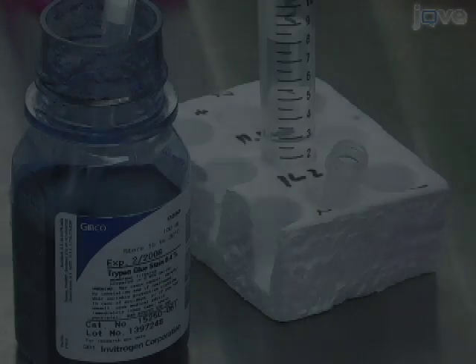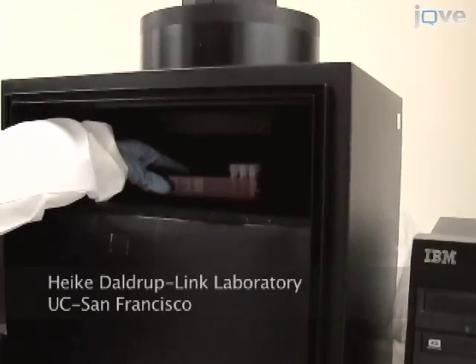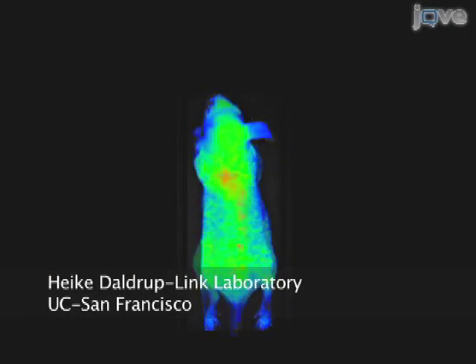This is our two-photon microscope setup. Two-photon microscopy is very good. When performing cell labeling, it's important to remember to standardize every step. We do this to ensure a consistent labeling efficiency and cell viability so that results from different experiments can be compared.